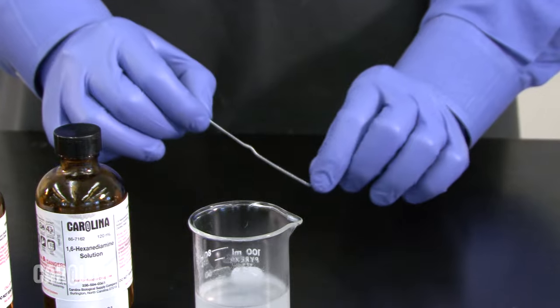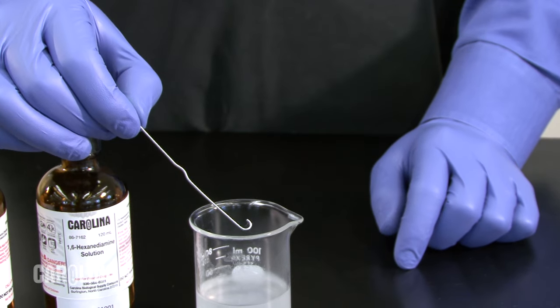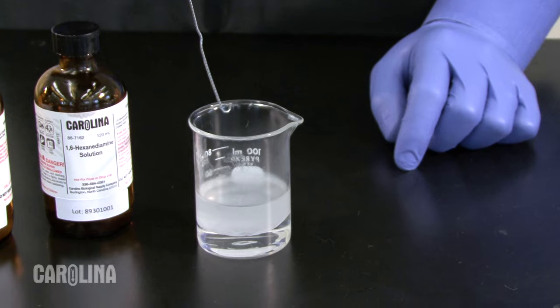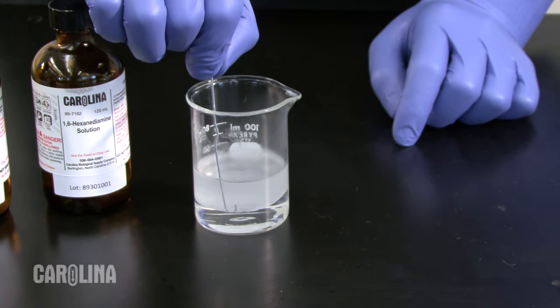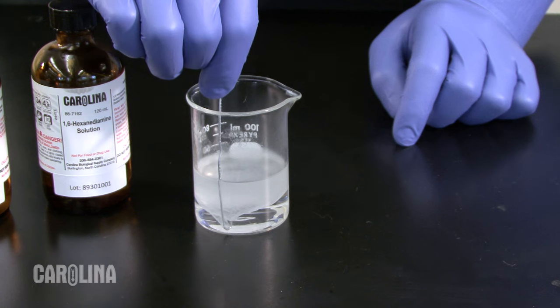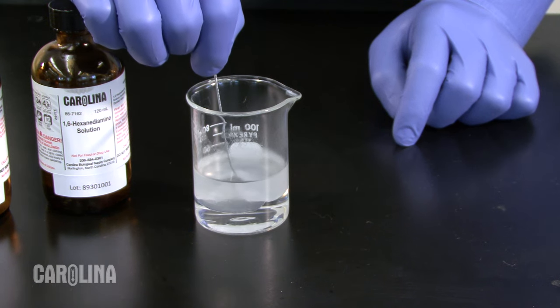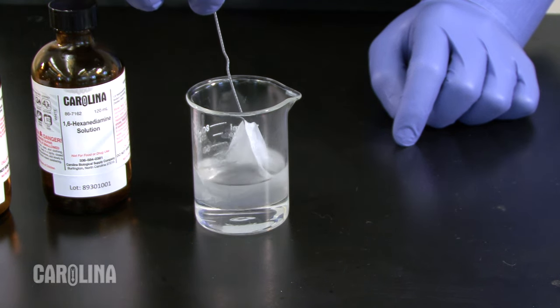We can extract our nylon using a wire with a small hook on the end, such as a bent paperclip. Lower the paperclip directly into the bottom layer and pull up slowly past the interface. You will observe a strand of nylon being pulled out of the solution.